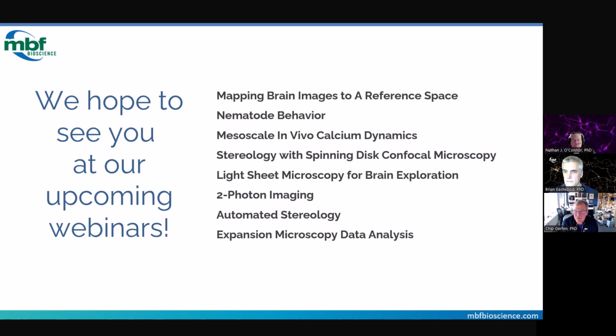Because we image through multiple planes through the section, which is important to make sure everything is properly focused, it takes 2 to 3 hours per slide. So we can do the imaging on a full slide in a little over a day and a half or so.